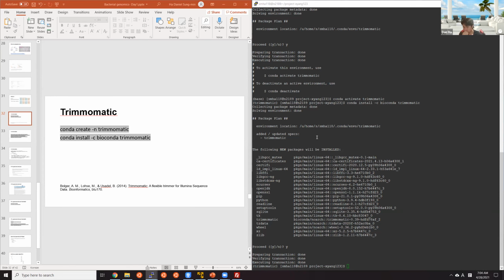I'm just gonna wait a few minutes here so that everyone install their software. If you have installed your Trimmomatic, can you give me a thumbs up so that I know who's complete? Will anything bad happen if I run this on the login node?